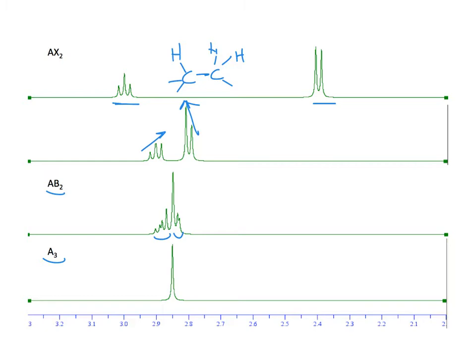Okay, so an important thing about this has to do with the difference in using different magnetic field strengths too. It has a big implication on this kind of thing. Excuse me. Let me add in one more.